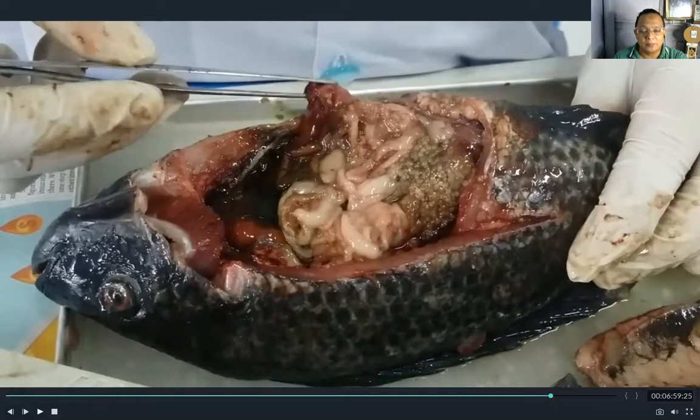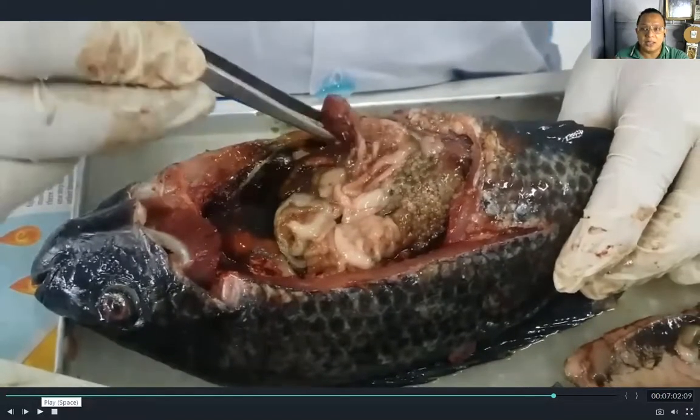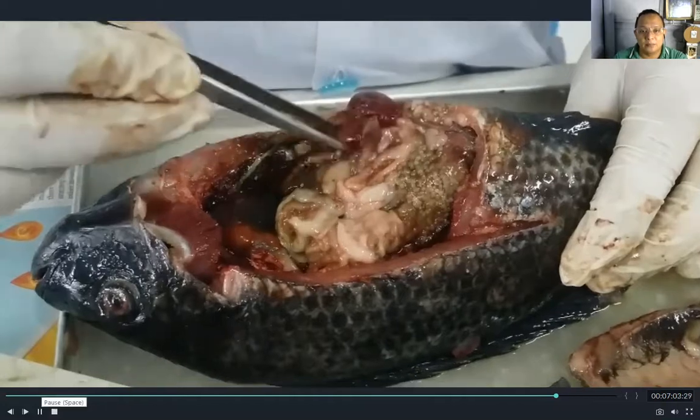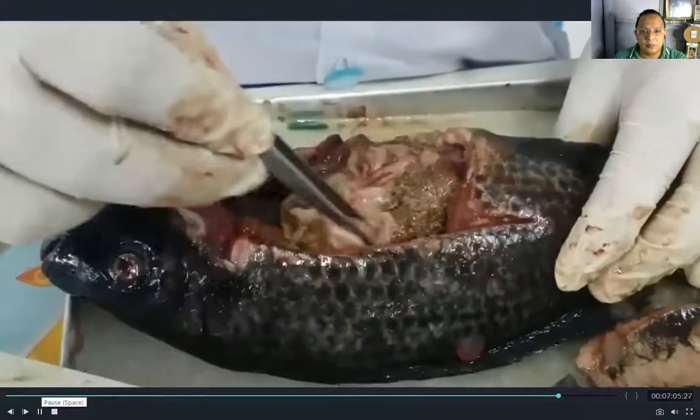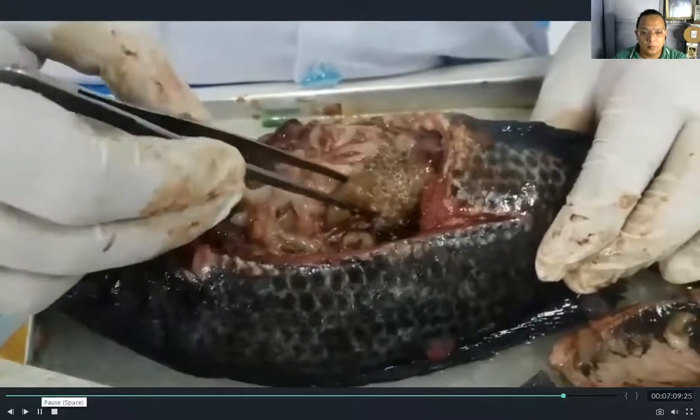This one is the liver. The liver is the organ responsible for the production of bile, which also maintains the normal blood chemistry of the fish.